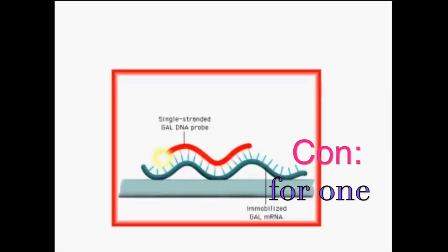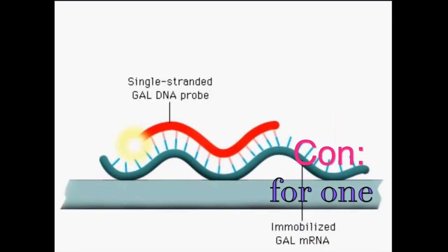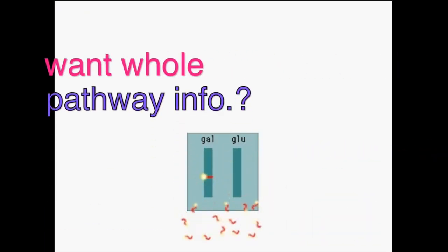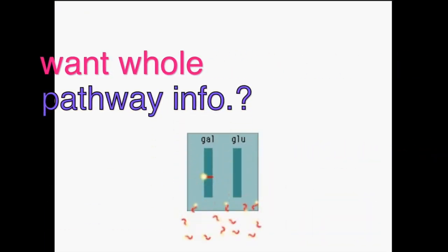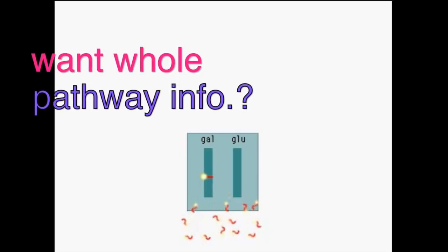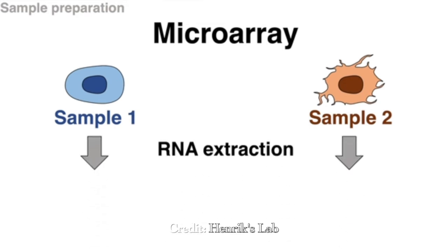predefined genes. However, when you want to perform a broader screening, for example, when you want to test which processes are affected by a certain drug, a certain compound, you can use different methods, and one of those is the microarray. Have you heard of microarrays before?